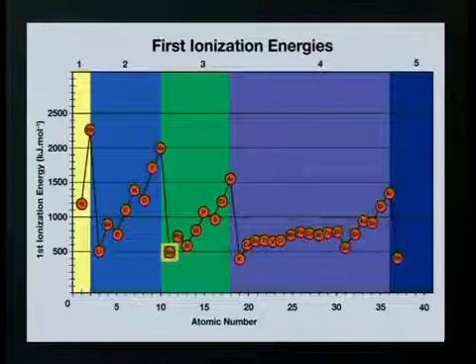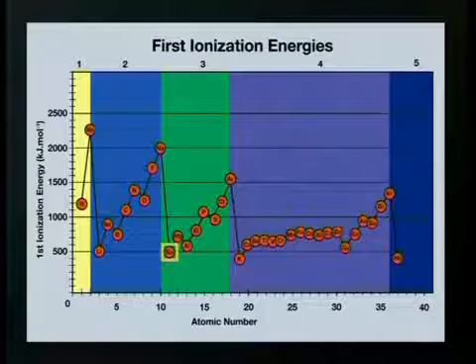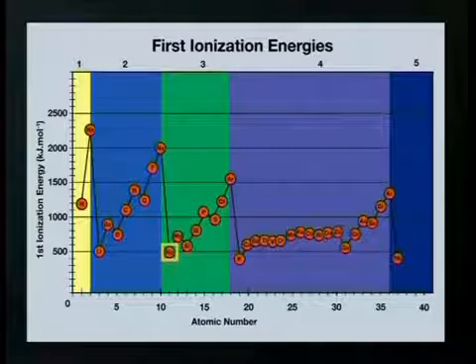You may remember that sodium atoms have a low first ionization energy. This means that a small amount of energy is required to make sodium lose one electron. When we put all of these facts together, I think we can predict that all of the group 1 metals will be very reactive. Let's start experimenting to see if our predictions are true.